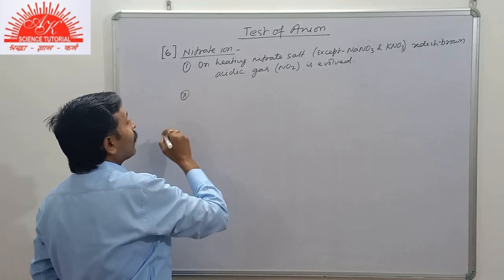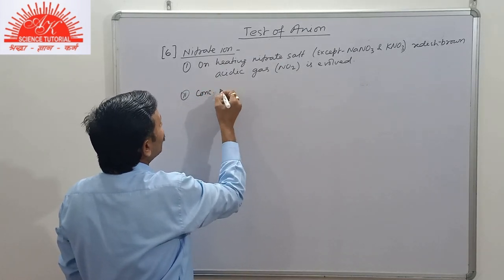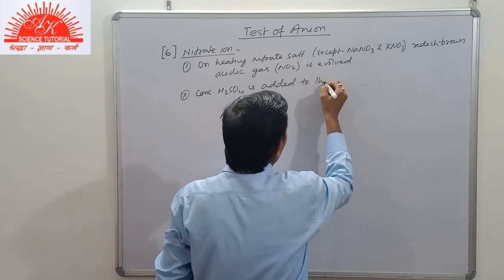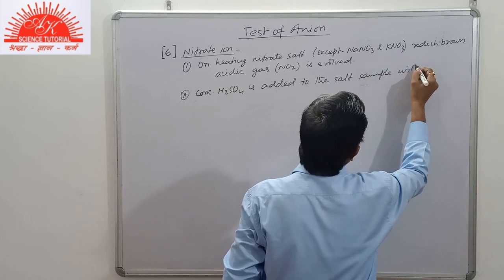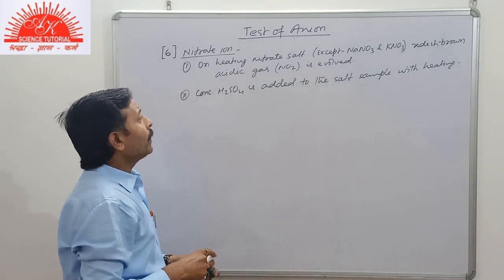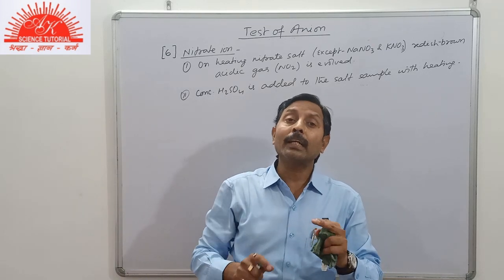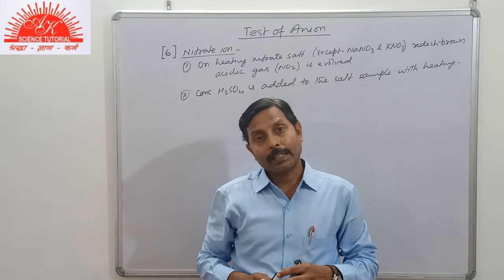So second, conc H2SO4 is added to the salt sample with heating. If there is a nitrate salt and conc H2SO4 is added to it on heating, it will give nitric acid, which will decompose to give NO2 gas.